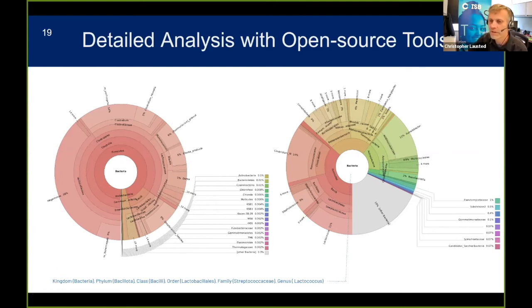These are two typical microbiomes. I believe these were two dogs. There were quite a few dog fecal samples contributed, and I think this is fairly representative. The most common phylum in all of the dog samples was Firmicutes. Some researchers believe that a high ratio of Firmicutes to other phyla like Bacteroidetes is unhealthy, but it's a little bit more complicated than that.